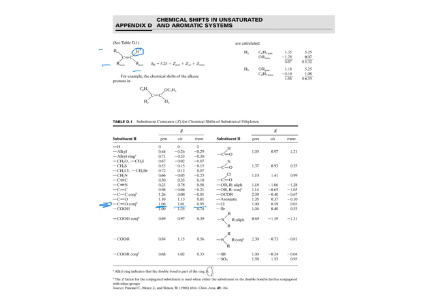Oh, so let's say if we have a methoxy group or something like that, then notice that if it's geminal, it shifts it downfield by 1.18, but if it's on the other end of the position, so if we have something like this, this carbon here would be 1.1 downfield, but at the other end, these are like minus 1.0 to 1.2, depending on its cis or trans.